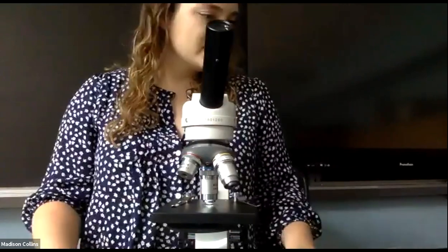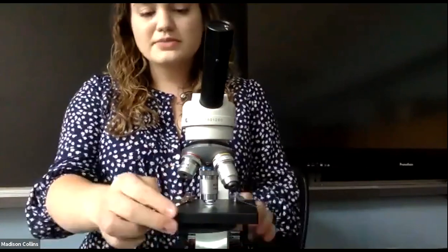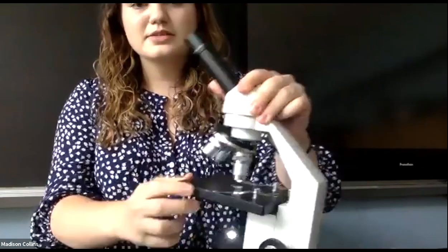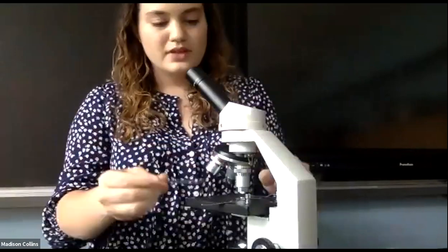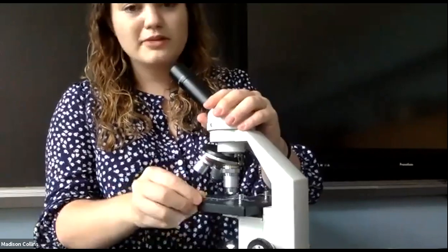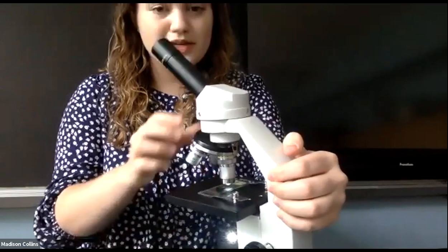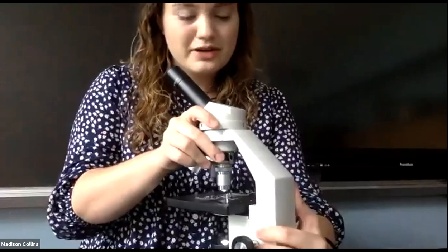All right, moving down, we've got our stage. So when it comes time to view a specimen using the microscope, you're going to place that specimen on this black square right here. This is called our stage. So I've got a slide right here, and I'm going to place it on my stage, and I'm actually going to hold it in place using these metal clips right here. These are my stage clips, and these stage clips allow me to hold that slide in place so it doesn't move around. So you can see if I move this microscope, the slide doesn't go anywhere.